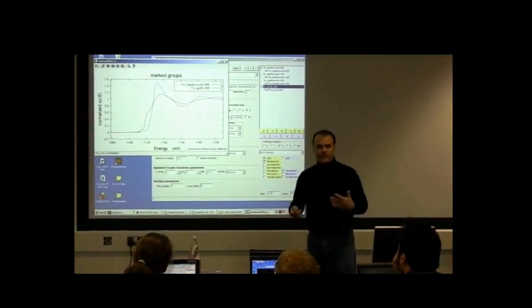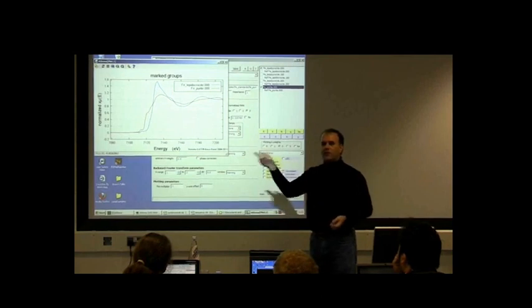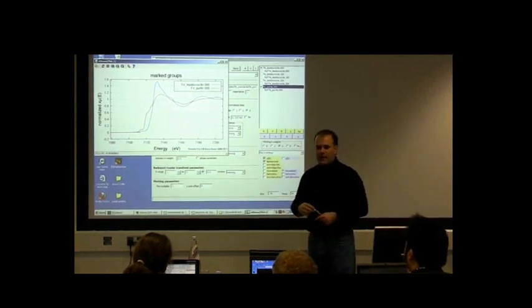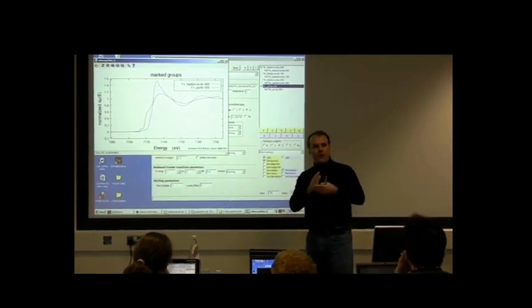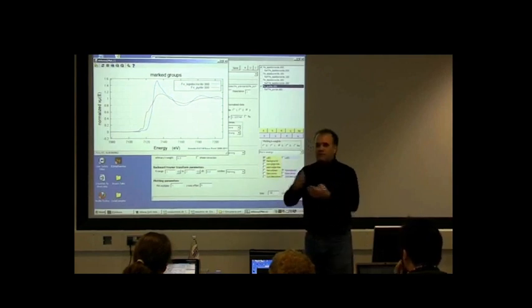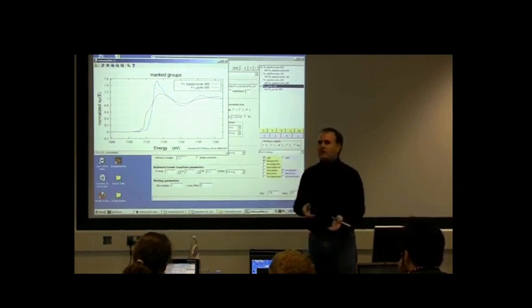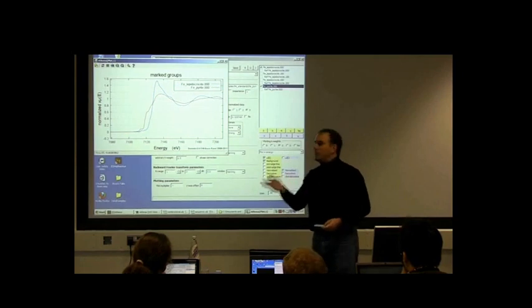Somebody was having the problem with the up and down quick scan data, that there was a significant calibration problem on the up scan compared to the down scan that had to be corrected after the fact. I'm not really certain how it's implemented at the beamline, but there was this problem, and it was off by tens of volts. So there are calibration problems that you have to worry about even on modern beamlines.